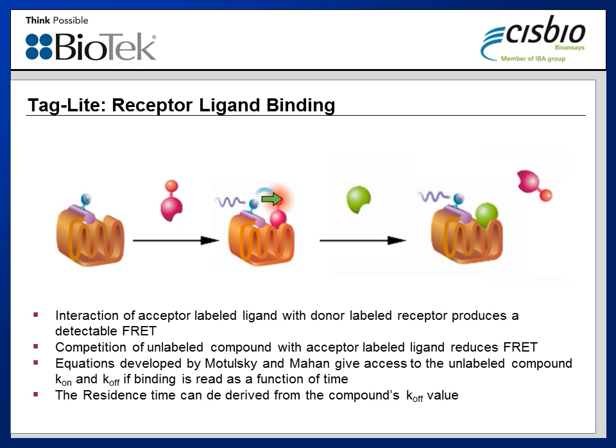The ratio continues to increase as the number of binding events also increase, eventually reaching a plateau over time, which again, as previously mentioned, is usually what has been monitored with these types of assays. Then if a molecule is introduced to the well, such as shown here in green, which interrupts the binding, this molecule preferentially binds to the receptor, kicks off the labeled ligand, and FRET does not occur, and then the ratio of the acceptor to the donor fluor decreases subsequently.